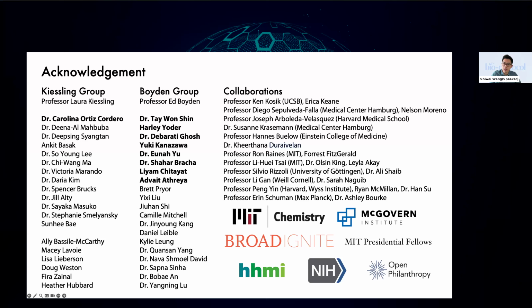The advantage of expansion microscopy, especially when you stain after expansion, is that the linker error, so the size of the antibody, is almost negligible, because the signal is already expanded and the antibody is about 10 nanometers divided by 20-fold expansion. So that's like a 0.5 nanometer linkage error. We haven't really observed any differences made by the boost antibody.